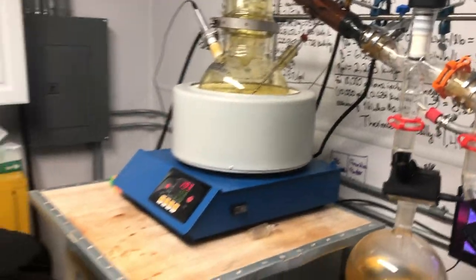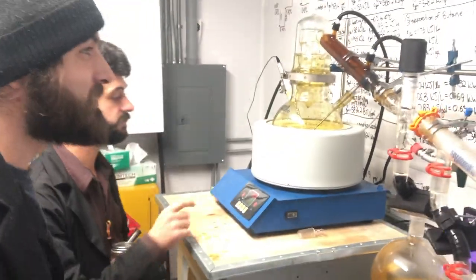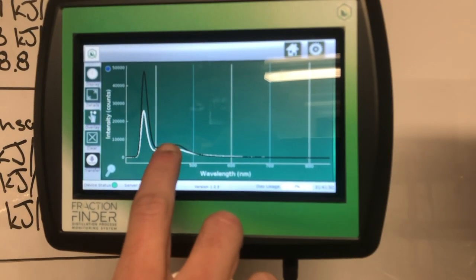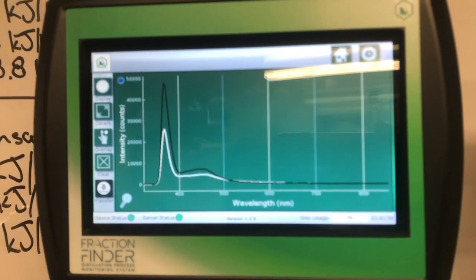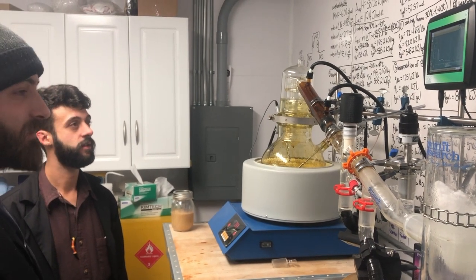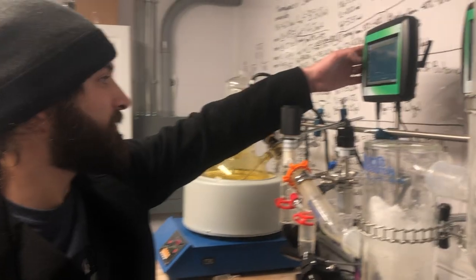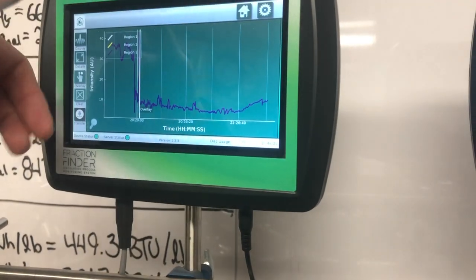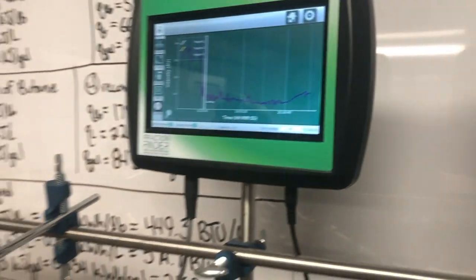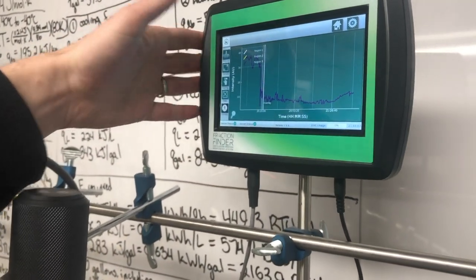Just a sign of the transition to tails, because look, the peak shifted. It's not super hard shifting. Here's where our peak is, like 5-10 nanometers to the left, and now we're 5-10 nanometers to where we were. We're shifting to tails right now. We're in the middle of the transition. The peak intensity is rising over time with the CBD indicator that we use, and that just indicates that we're going to tails.